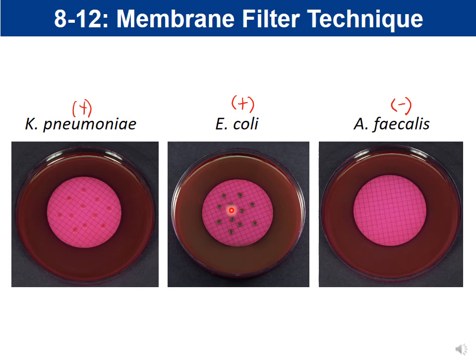So it acts as a point of comparison to determine any bacterial growth, because the endo agar is only going to tell you about gram negative bacteria in the water. Because again, in the endo agar, we're looking for coliforms specifically. Nutrient agar control acts as a control to look at all microbial growth. So we're not just looking at gram positive, we're looking at gram positive and gram negative. And so that would be your answer for number 137, is that it is a control to look for all microbial growth.